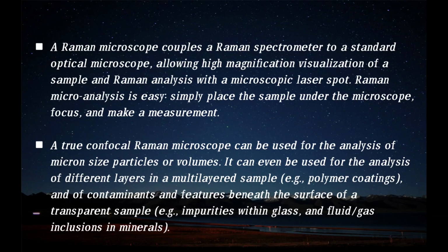A true confocal Raman microscope can be used for analysis of micron sized particles or volumes. It can even be used for the analysis of different layers in a multi-layered sample, and contaminants and features beneath the surface of a transparent sample.